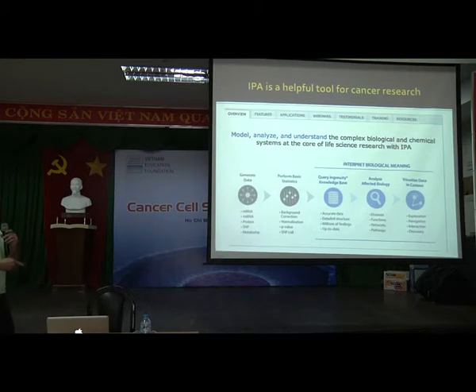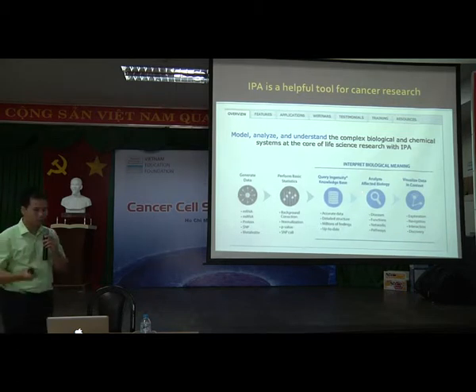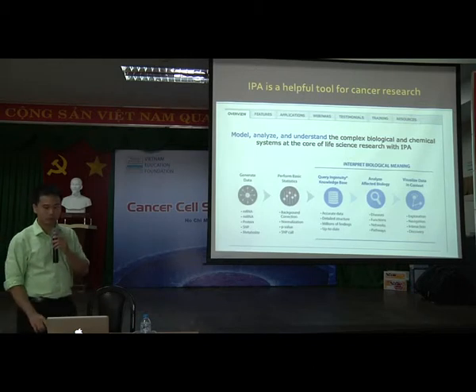And as I mentioned earlier, we need to collect the data by ourselves, okay? And we will follow some basic statistics like doing the correction, normalization, calculating the p-value, or doing the SNP call, etc. And once we have these raw data ready to upload to IPA, then we just register our IPA account and then upload those data. And IPA will help us to analyze the biology and to visualize the data in context, meaning that you can export those data as a figure for your paper.